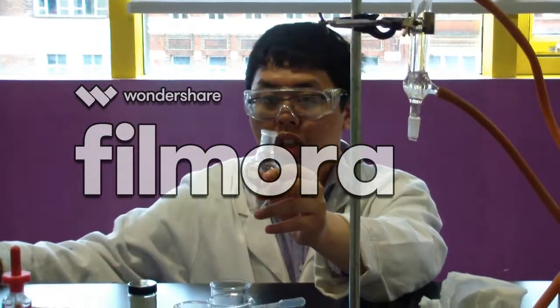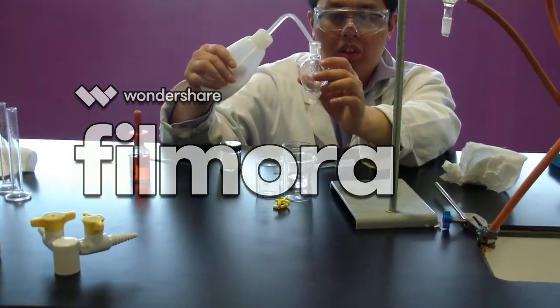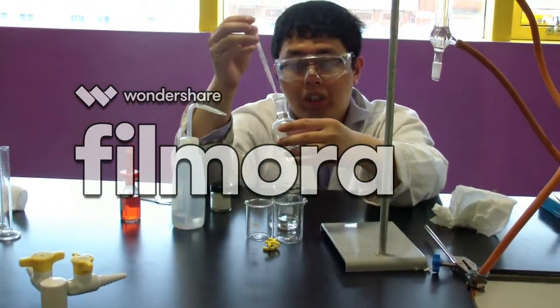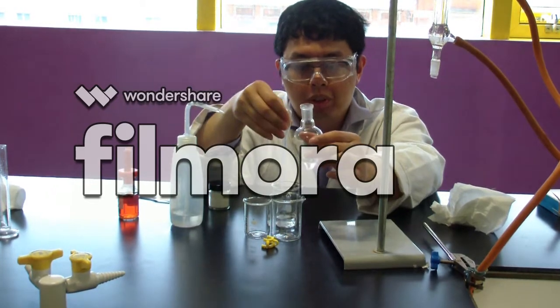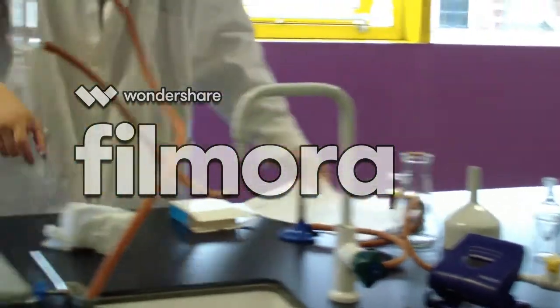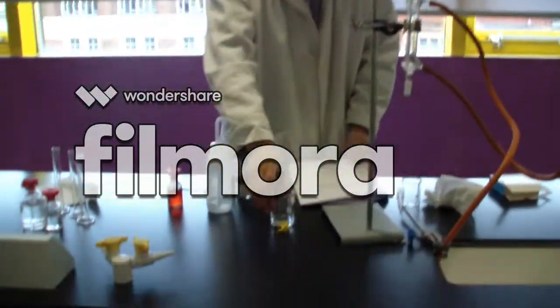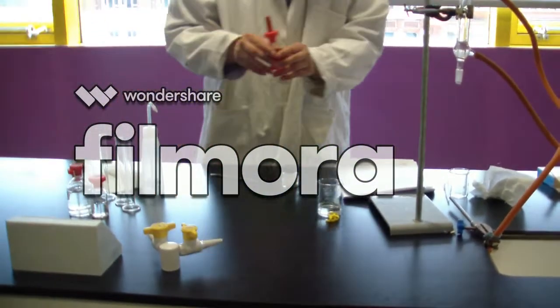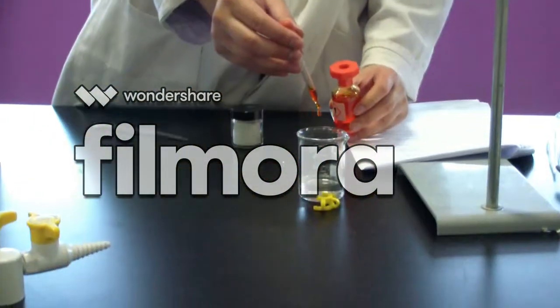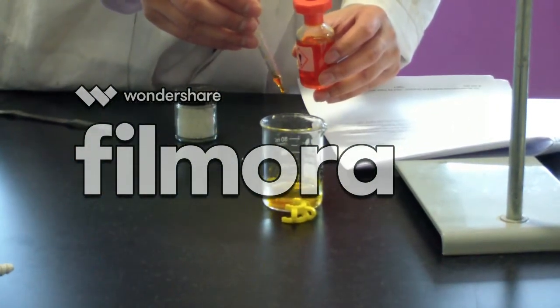Okay, I'll wash the pear-shaped glass with distilled water, and then place this solution together with the other solution. There you go. Now here's the solution, and then I add 10 drops of methyl orange. One, 2, 3, 4, 5, 6, 7, 8, 9, 10.